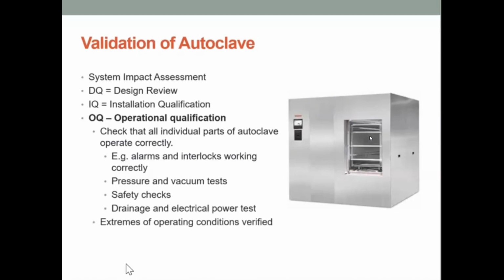Then we would look at the extremes of the operating conditions, the highs and the lows. Does it do what it's supposed to do? We would do some heat distribution studies then of an empty autoclave, so we would be looking for the cold spots in the autoclave.